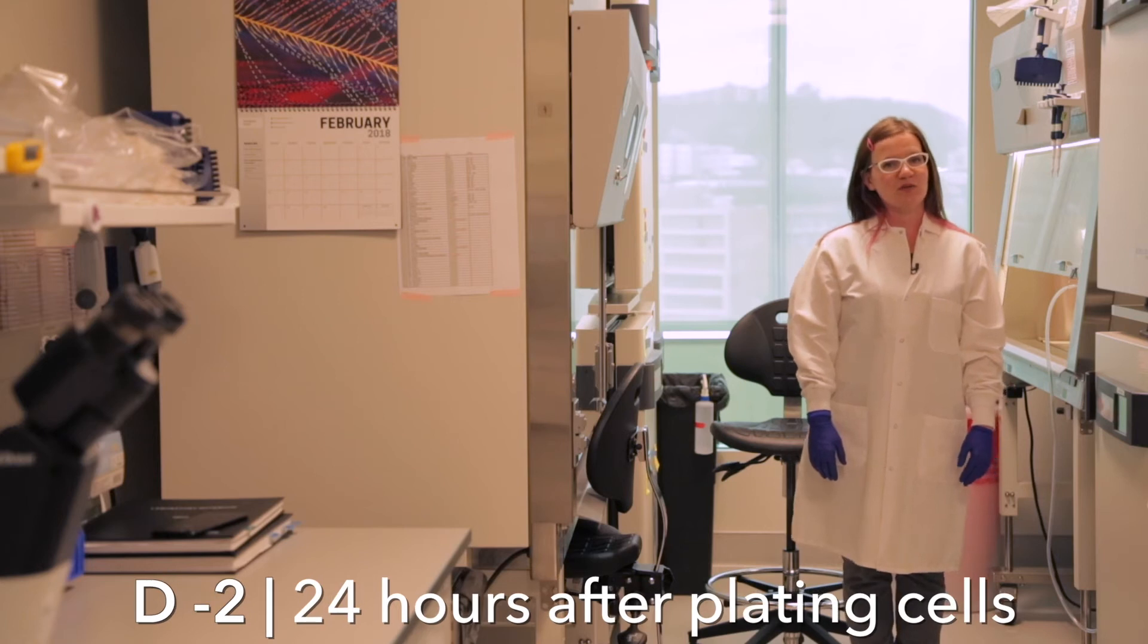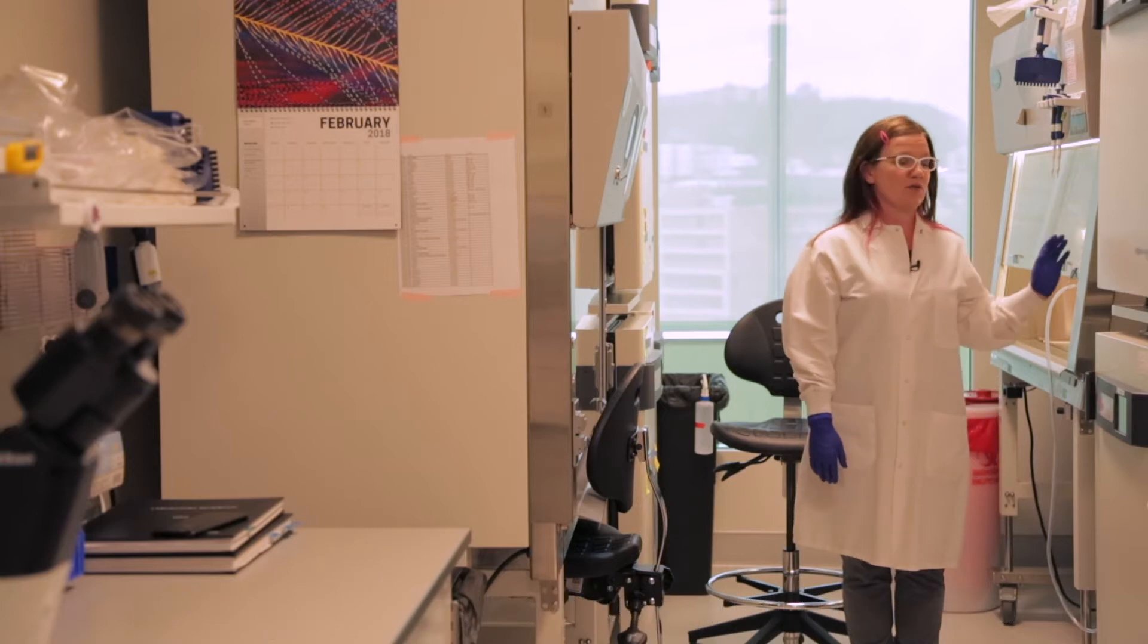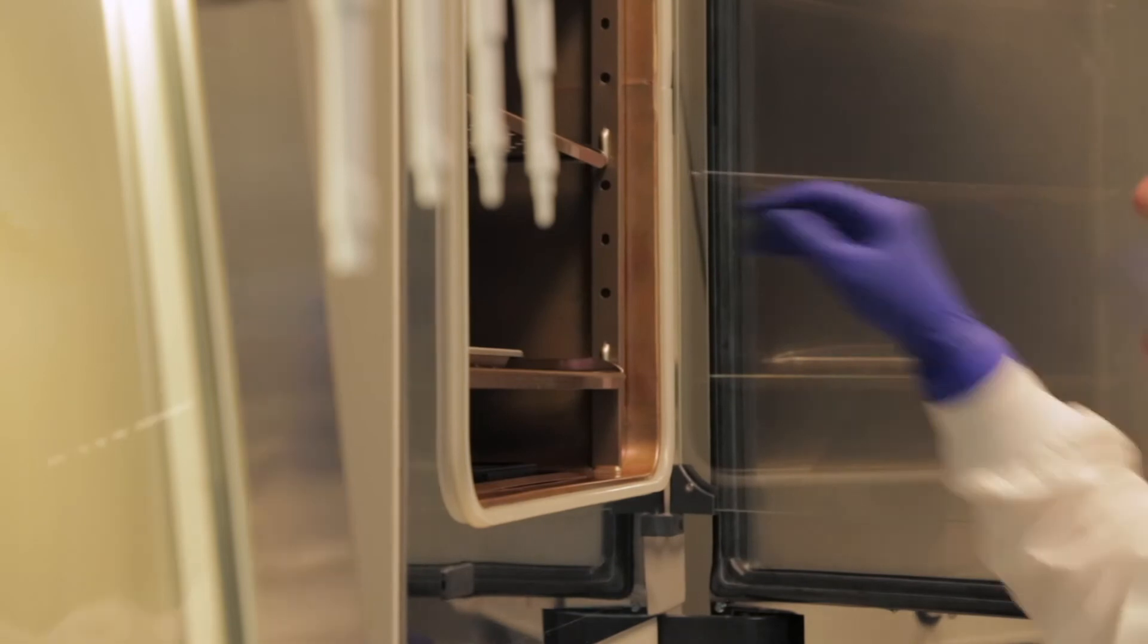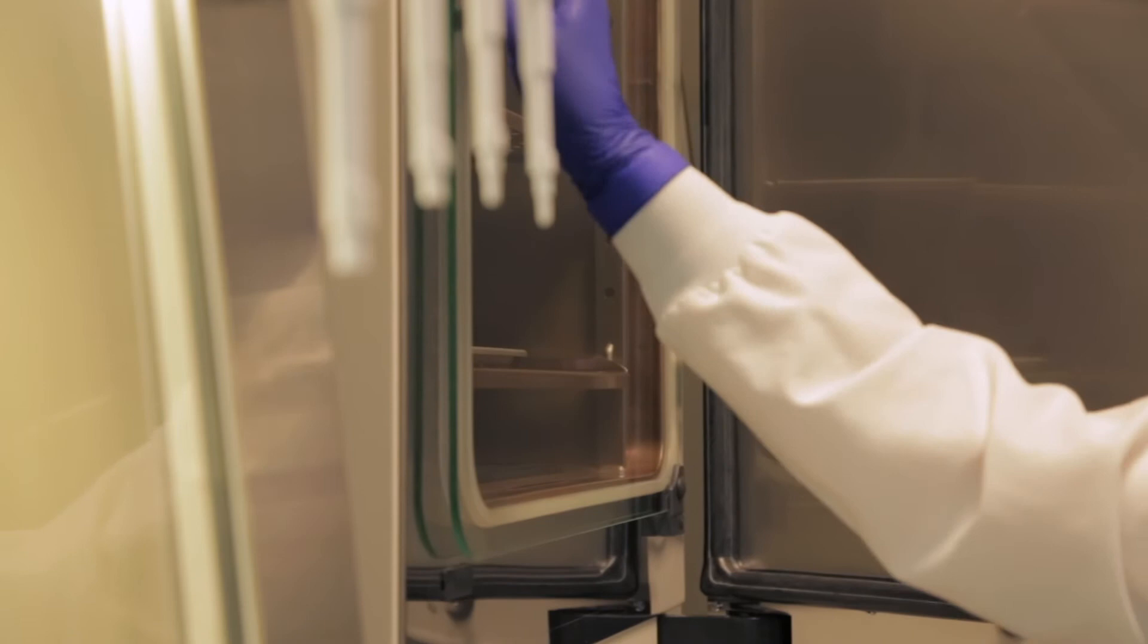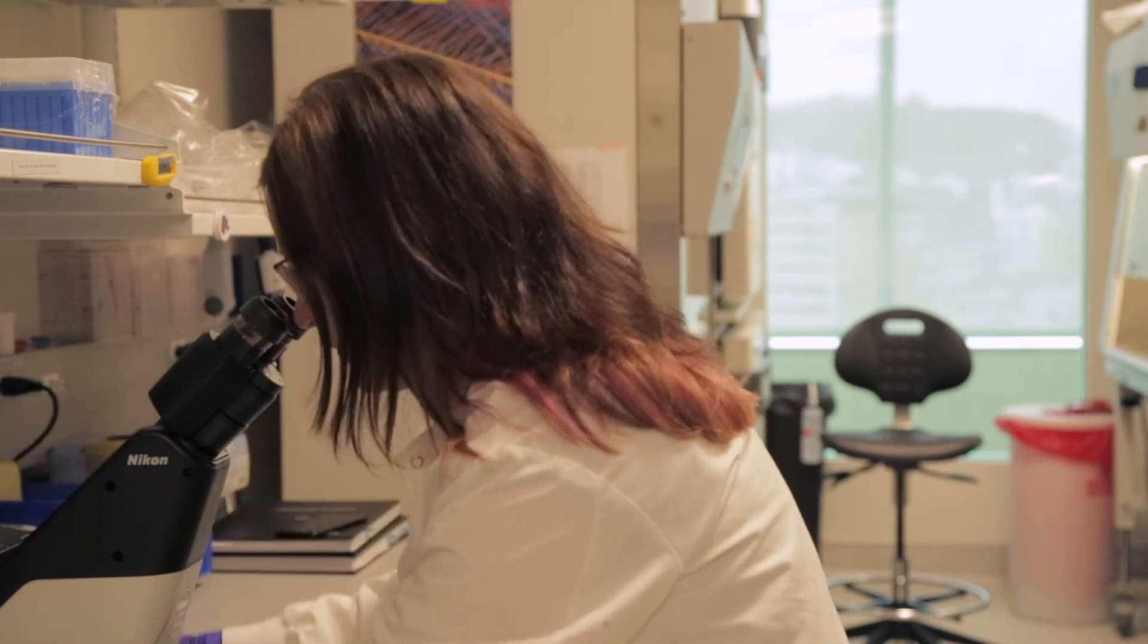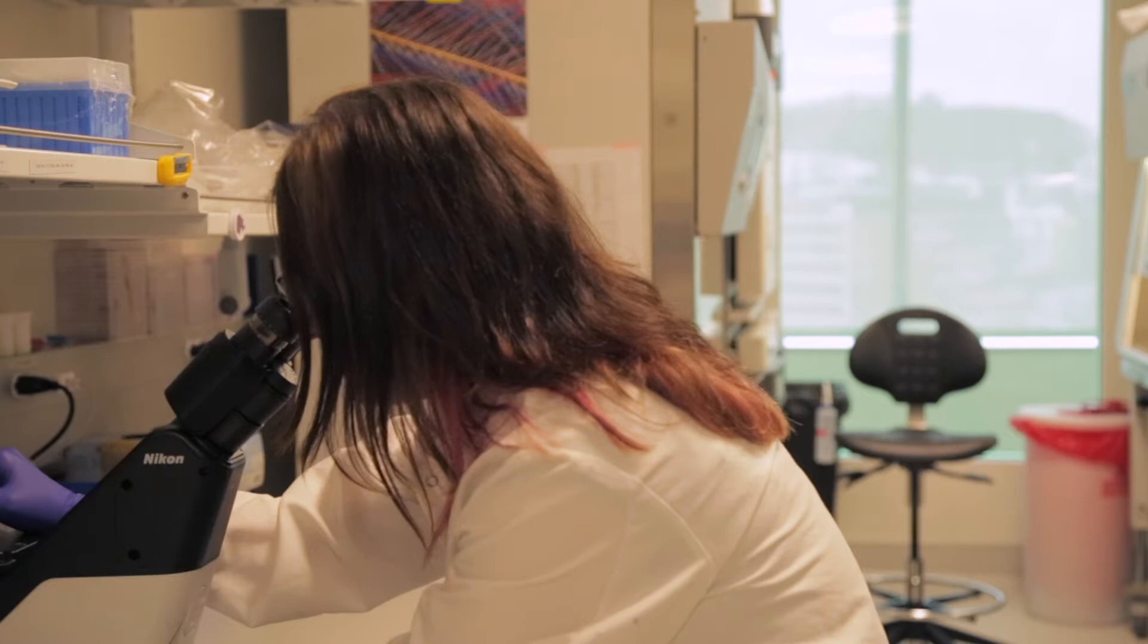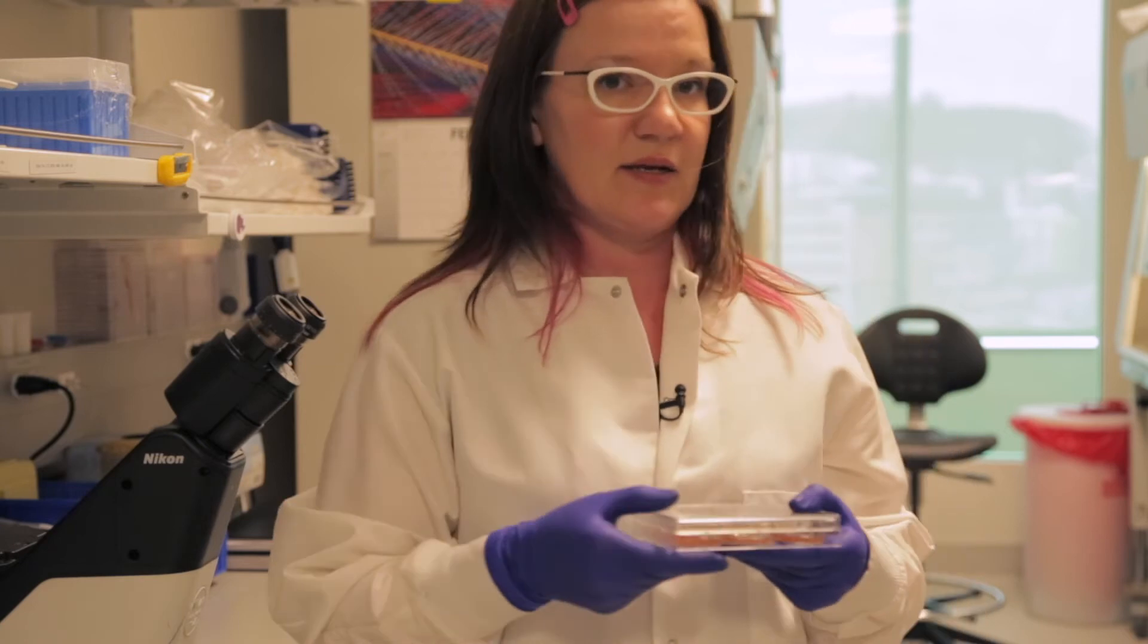So we just put the cells in the incubator. We're going to leave them undisturbed and check them tomorrow. Yesterday we plated the cells for differentiation, and in our protocol that's denoted as day minus three. Let's get them out of the incubator and look at the morphology. These look good. What I'm looking for is a nice, even distribution of the cells around the well and not very much cell death.